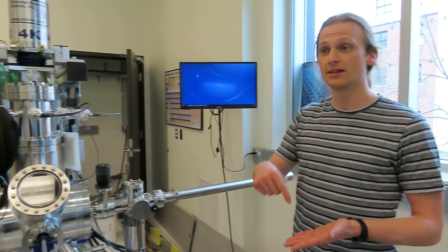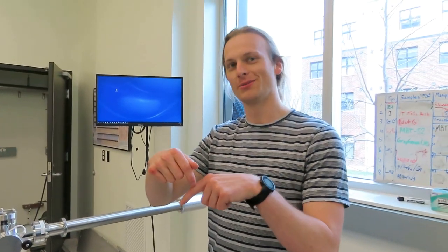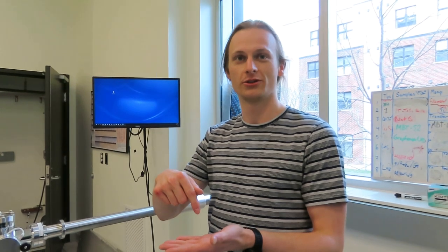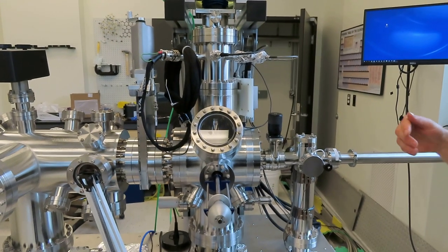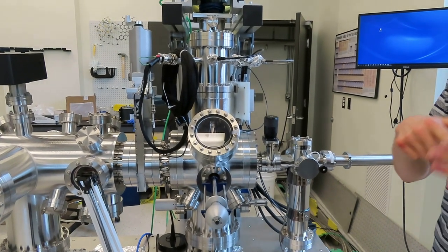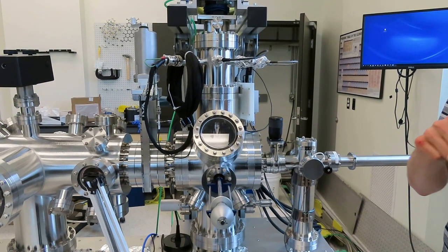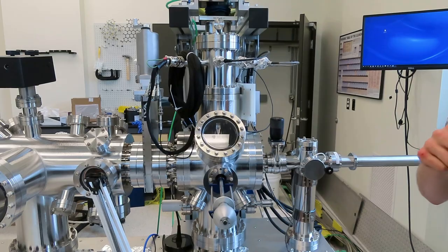The reason we need to do that is because if you have your tip and your sample, and a molecule of air gets between your tip and your sample, it's going to mess up your image. So you want to get as much of the air as possible out of your chamber before you do an experiment. The other thing this can do is bring your sample down to a low temperature. As things heat up, they're shaking more and more, so if you have a tip above a sample and they're both shaking, you get a much worse image than if you can get them to be still.